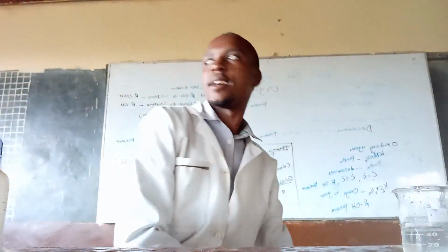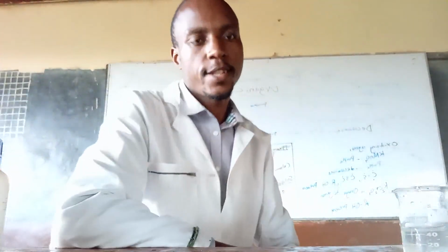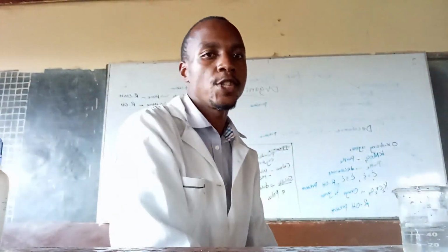Hello and welcome to today's lesson whereby we are testing for the presence of anions, or negatively charged ions.